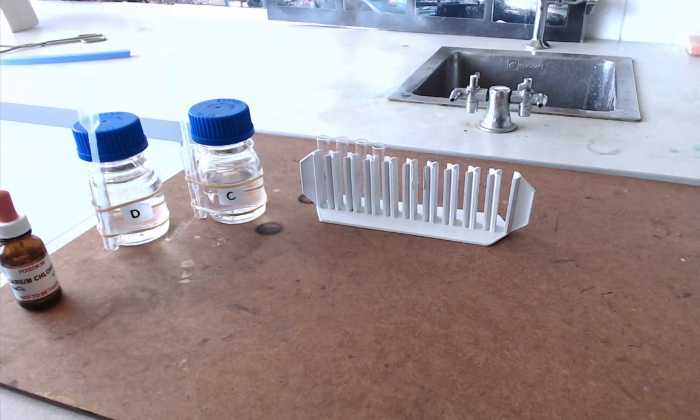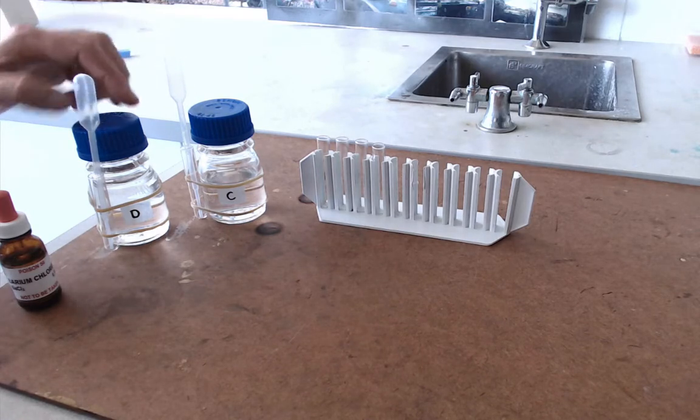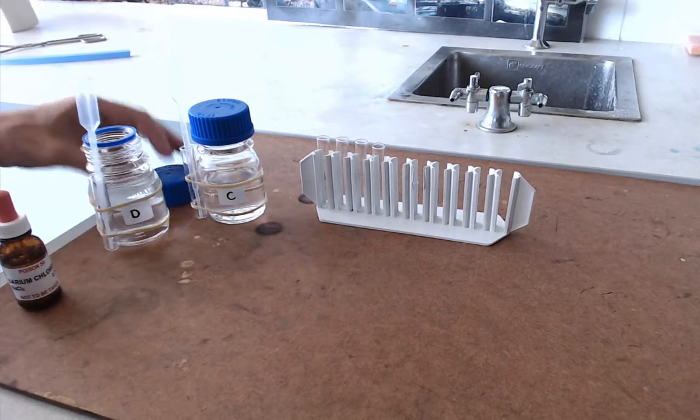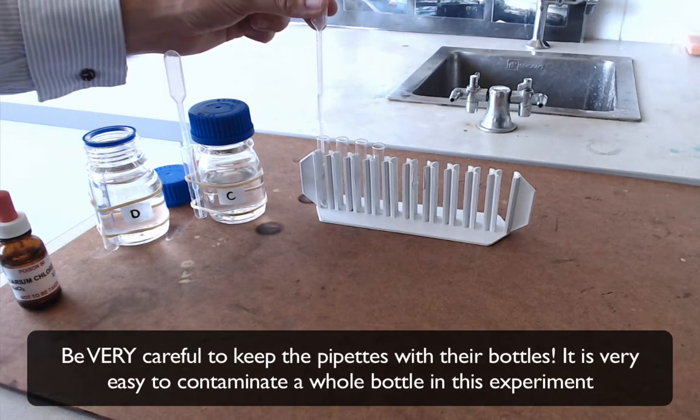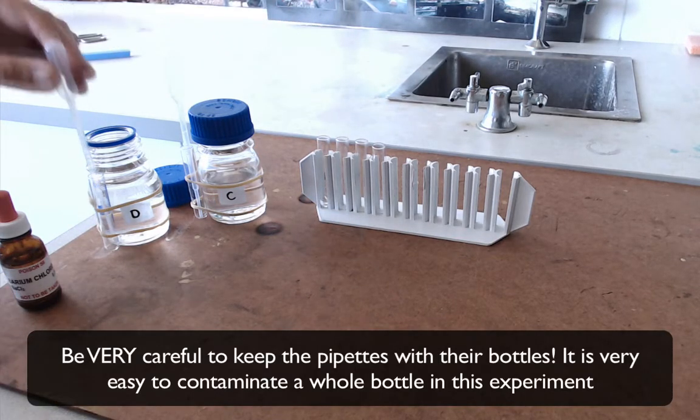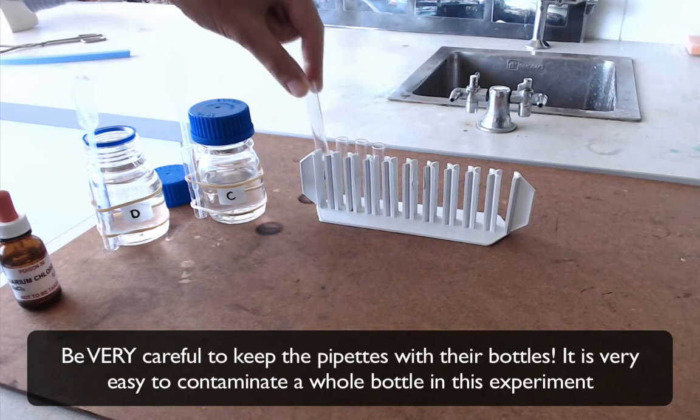Basically, each of the sets of tests involves putting just a few drops of each of these liquids into a test tube. So take a few drops of substance D and put it into one test tube. These are mini test tubes that we're using, so a few drops actually looks like quite a lot in the tube.